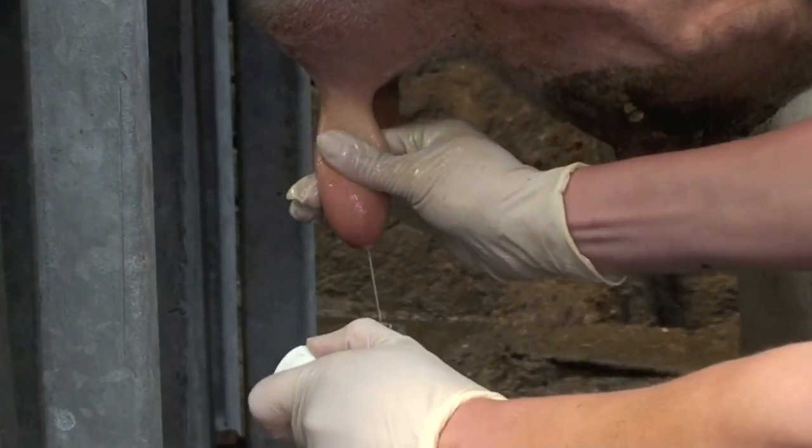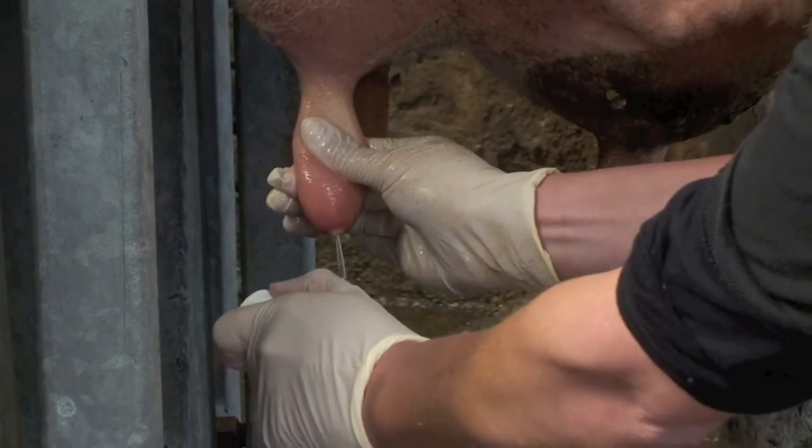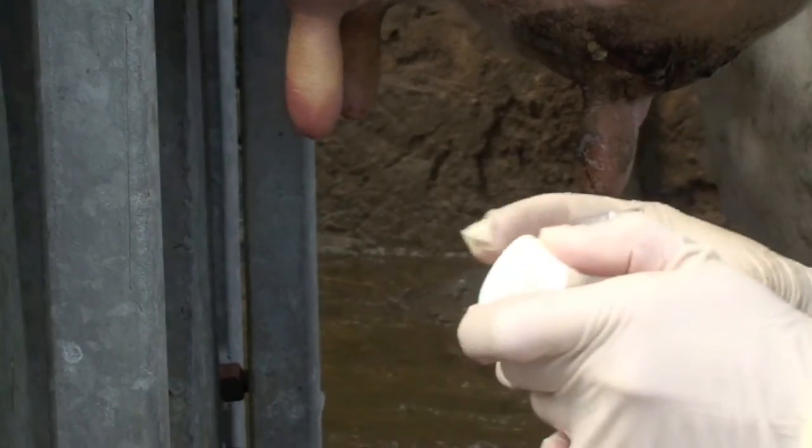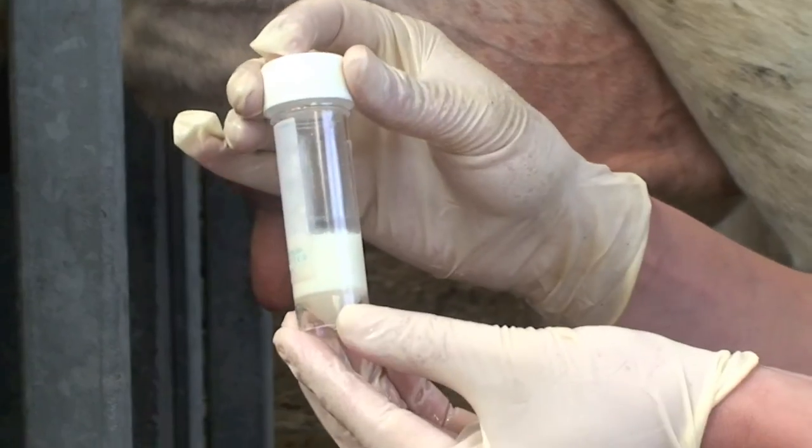We're going to discard the first bit of foremilk and then get a squirt straight into the pot, and put the lid straight on. That's all the sample we need — just one decent squirt worth to make sure we have a few mils.